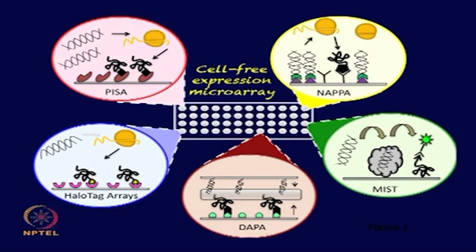So, in general, protein microarray technology allows the identification and quantification of proteins in a high throughput manner. The recent advances in protein microarray technologies offer unique opportunities to find novel biomarkers as well as apply this platform for several applications. The combination of proteome scale technologies, especially protein microarrays, has potential for a wide variety of biological applications.